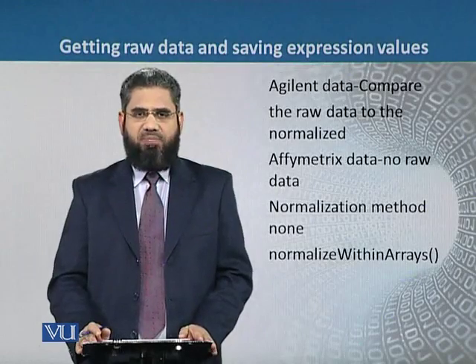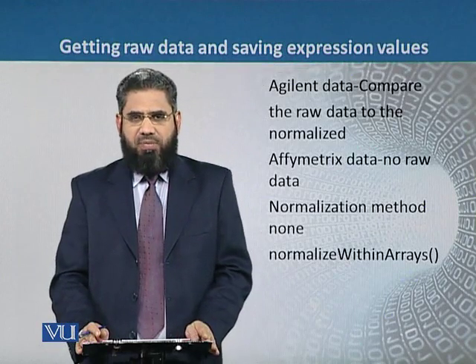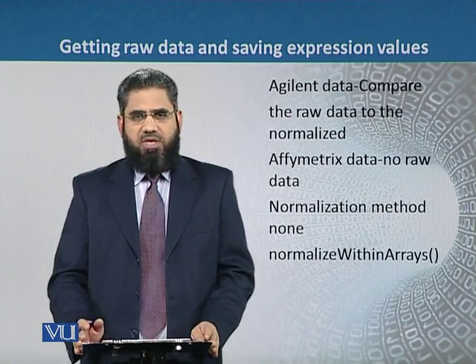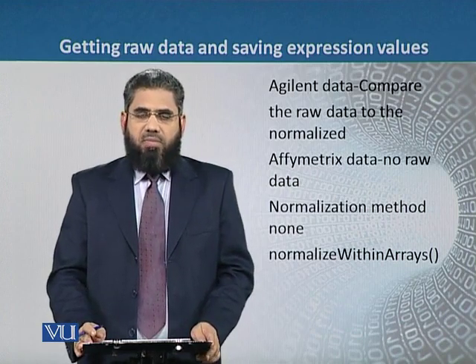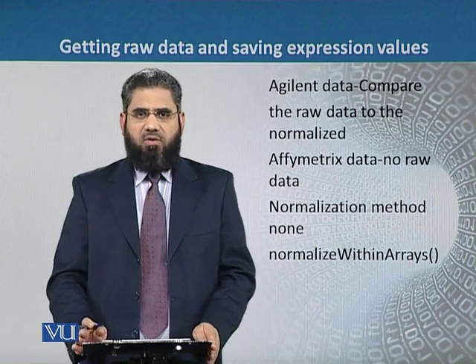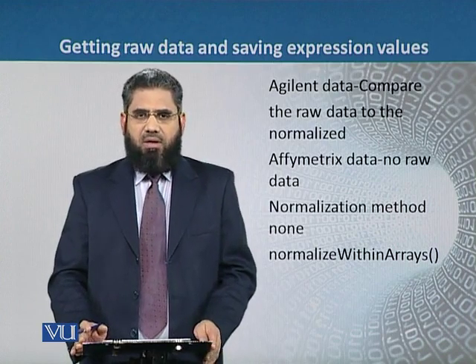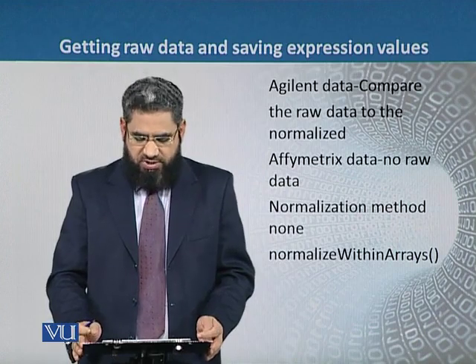Previously, we have seen how we can convert the raw data into the normalized data. But sometimes it is useful to obtain the raw data and to see the values of the raw data also. And after obtaining the raw data, we can compare the raw data with the normalized data, and we can see the difference, and we can also see the change in the data that helps in the quality control process.